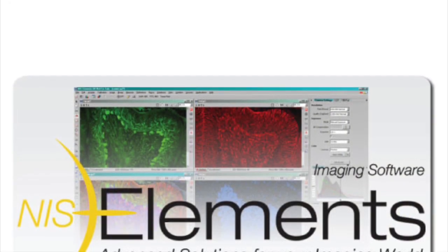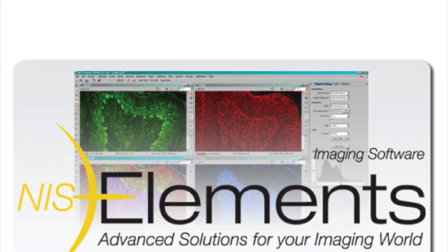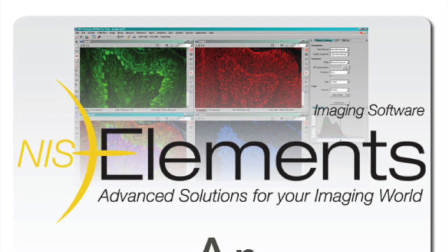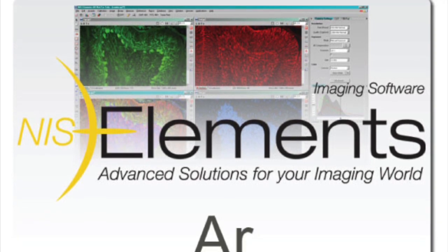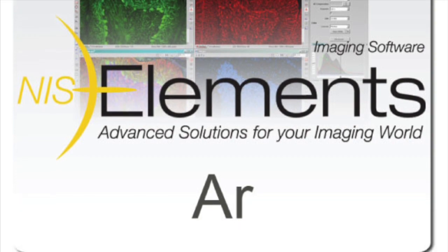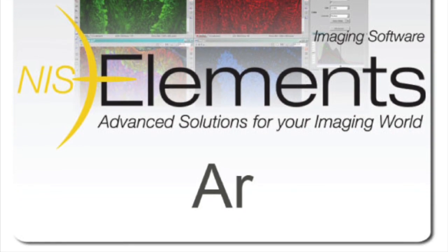Step 8. The NIS logo will appear and stay on the screen while the program files are loading. This may take about 1 minute. If the program files do not load, you may have forgotten to switch on the microscope unit. Check once more before proceeding to the next step.